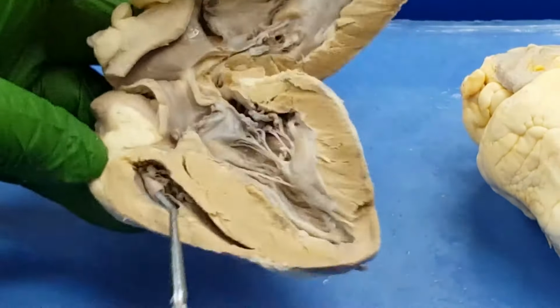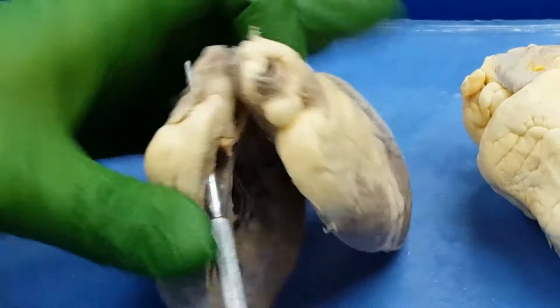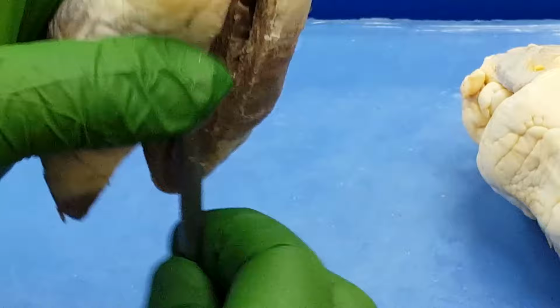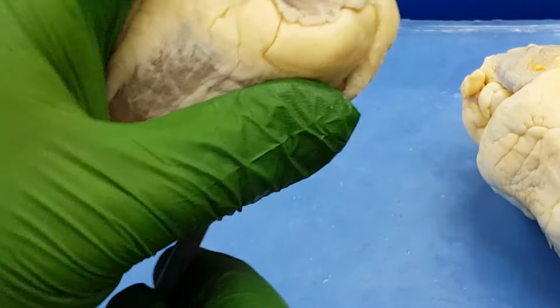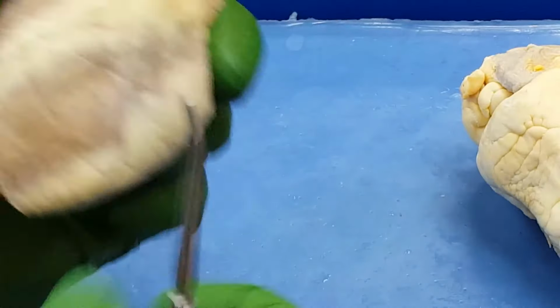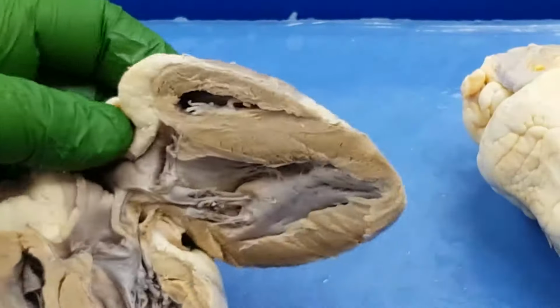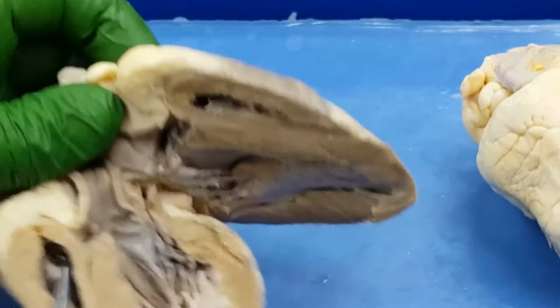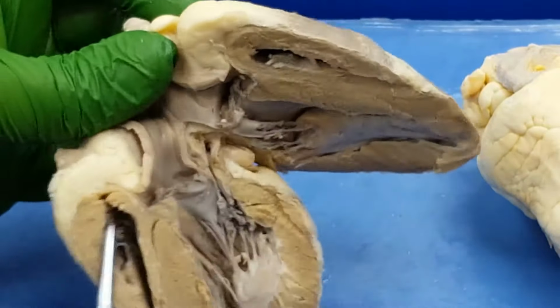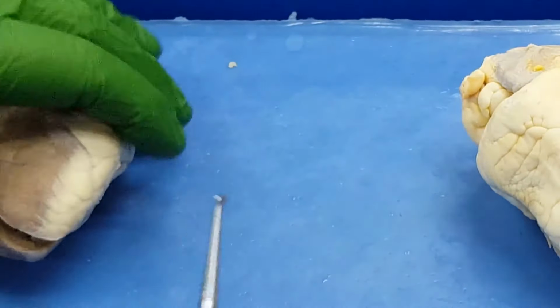Over here, the right atrium is always a little tough to get to, not with my probe, that's pretty easy. So everybody look, see the tip of my probe moving around this auricle on the right side. So the right atrium is up in here. There's a big empty space that my probe is waggling around in here. Let's look at the other heart.